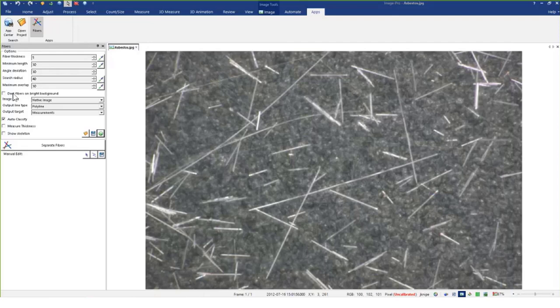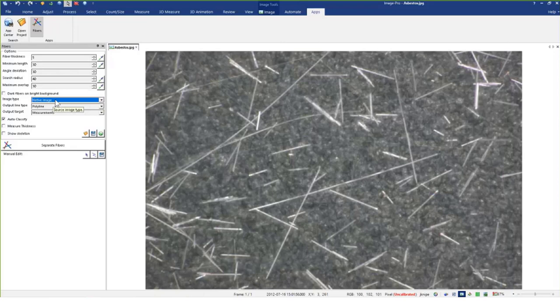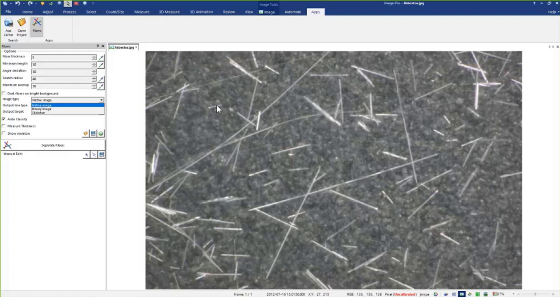What type of fibers are you measuring compared to the background — are they dark fibers on a bright background or bright fibers on a dark background? Input image type is an important one when you have difficult-to-analyze fibers. We have a choice: I'm going to start with the native image. We also have the option of working with a binary image — in some cases you have fibers that are really buried into the background, hard to distinguish, not a lot of contrast. Depending upon the material, sometimes you need to use a binary mask image, which requires some image processing to bring those fibers out.